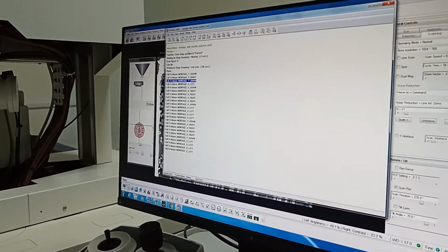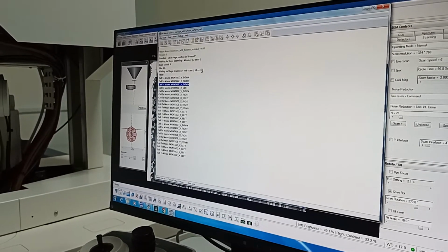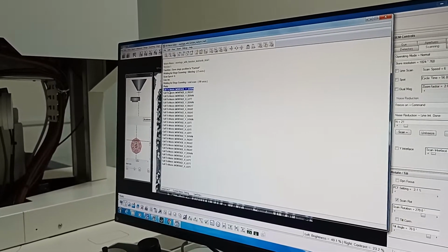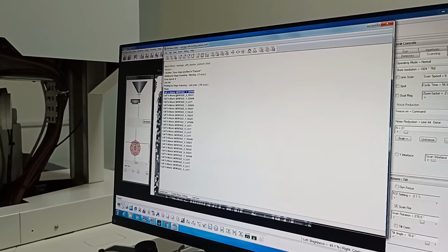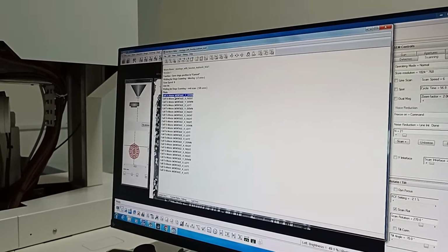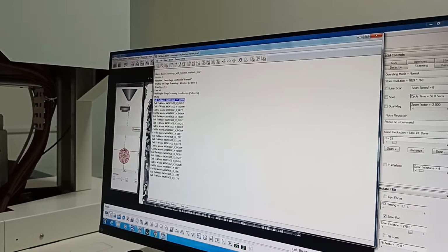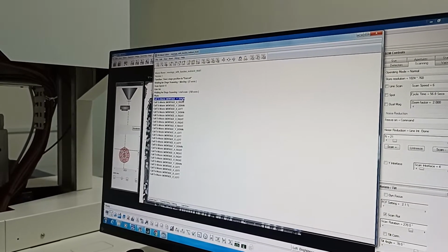Okay. So we are done with this initial stage, and why this initial stage, initial values are there, we will discuss it in a bit. So first, let's see what this next command is: call to macro montage y down. This is the name of the macro, and this is the function to call this macro inside this main macro. So you need this command, call to macro. Now we will see what is there inside this macro, and if required we will edit it.